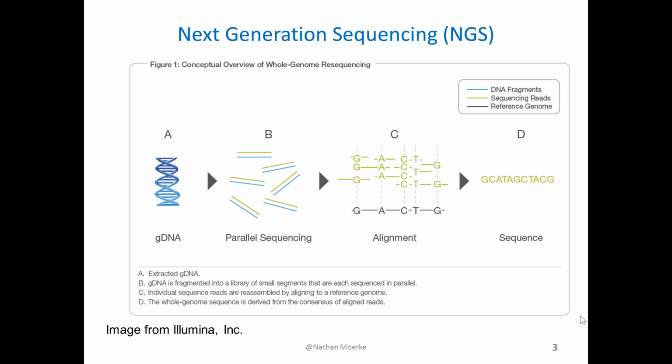And what you have is a large collection of small DNA sequences called reads, which then can be aligned to a master reference DNA sequence composed of the entire genome of an organism that you're studying. Then, once you've aligned all your individual reads to the master genome reference sequence, you've reconstituted the entire unique genome sequence of an individual human being or a unique microorganism that you're studying in the experiment.